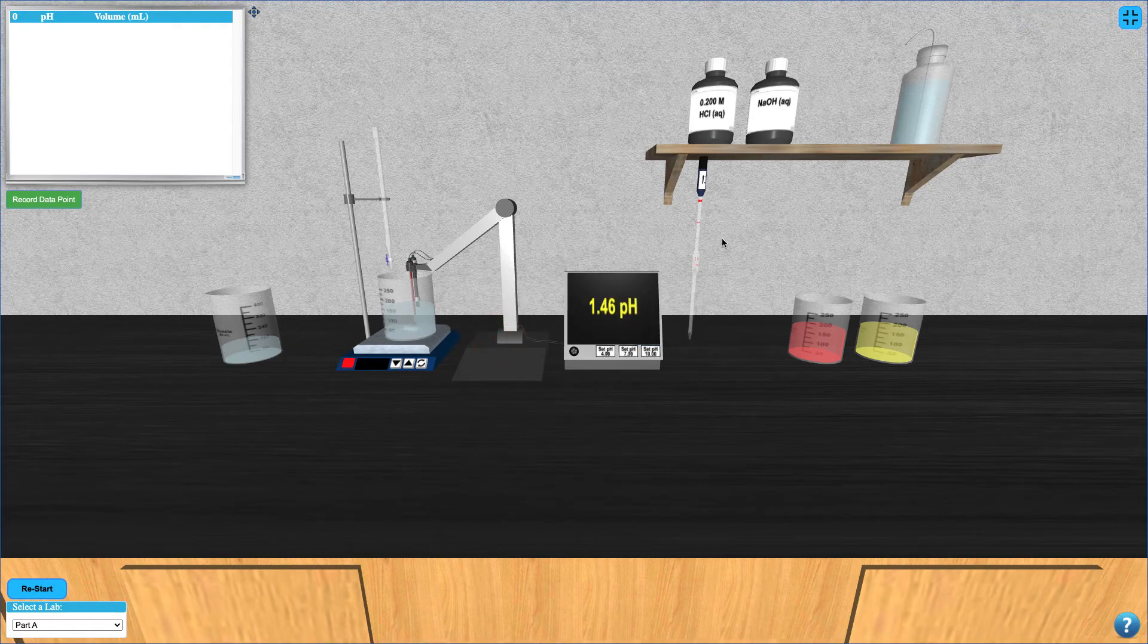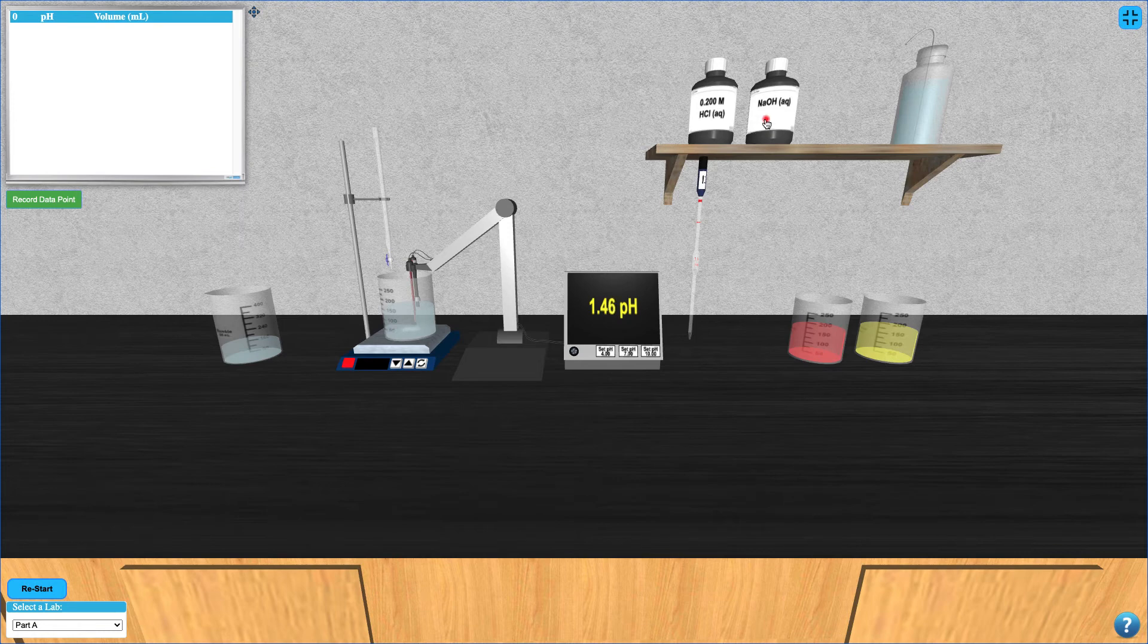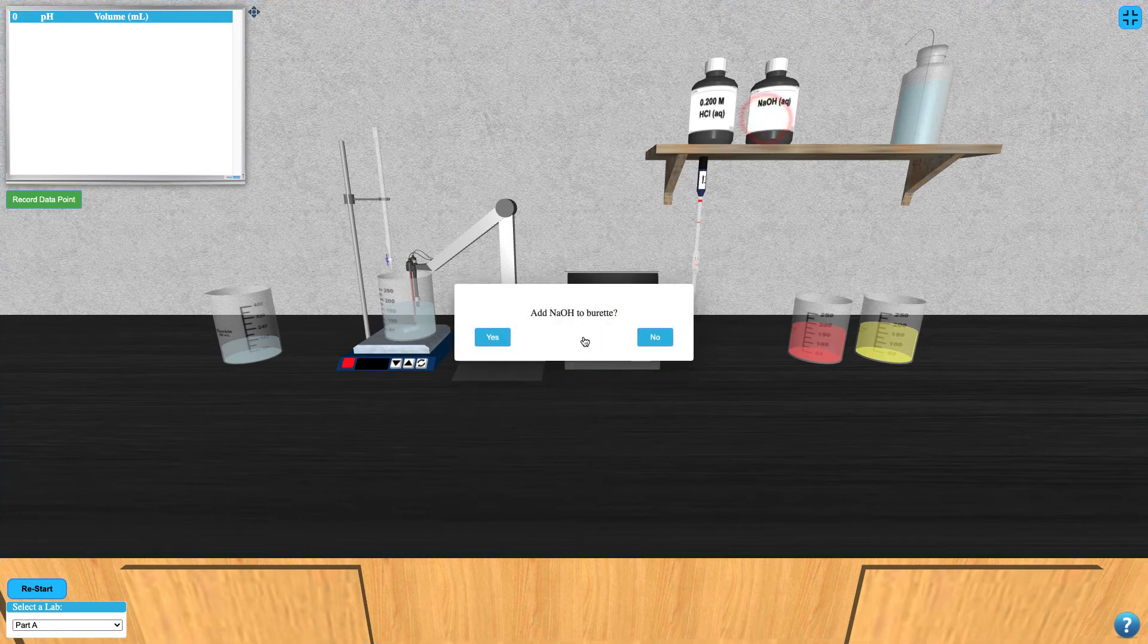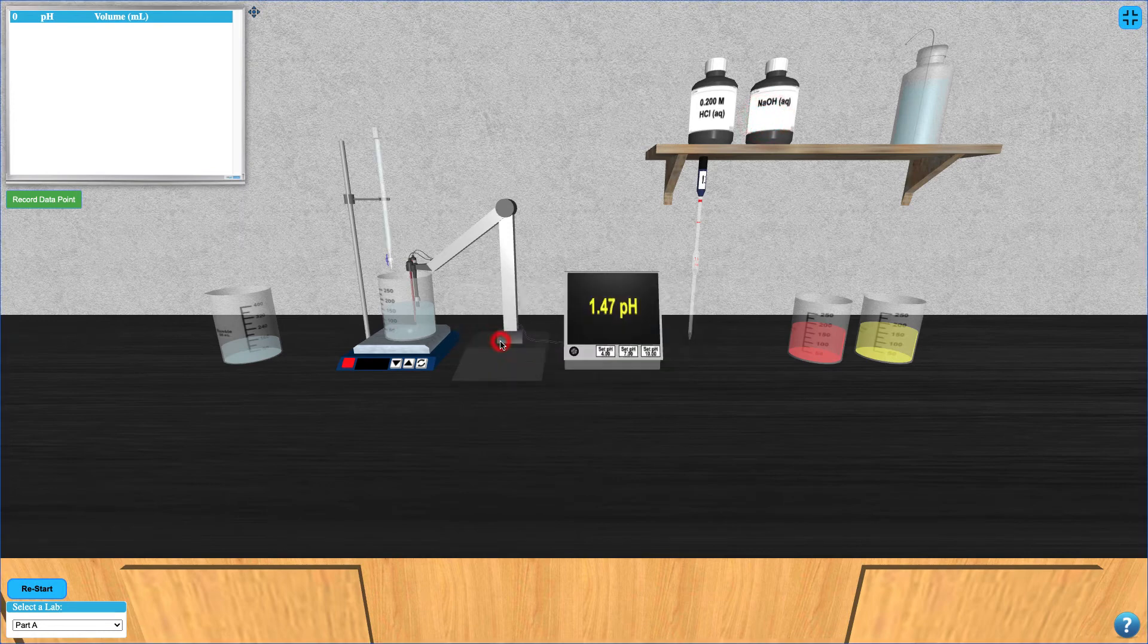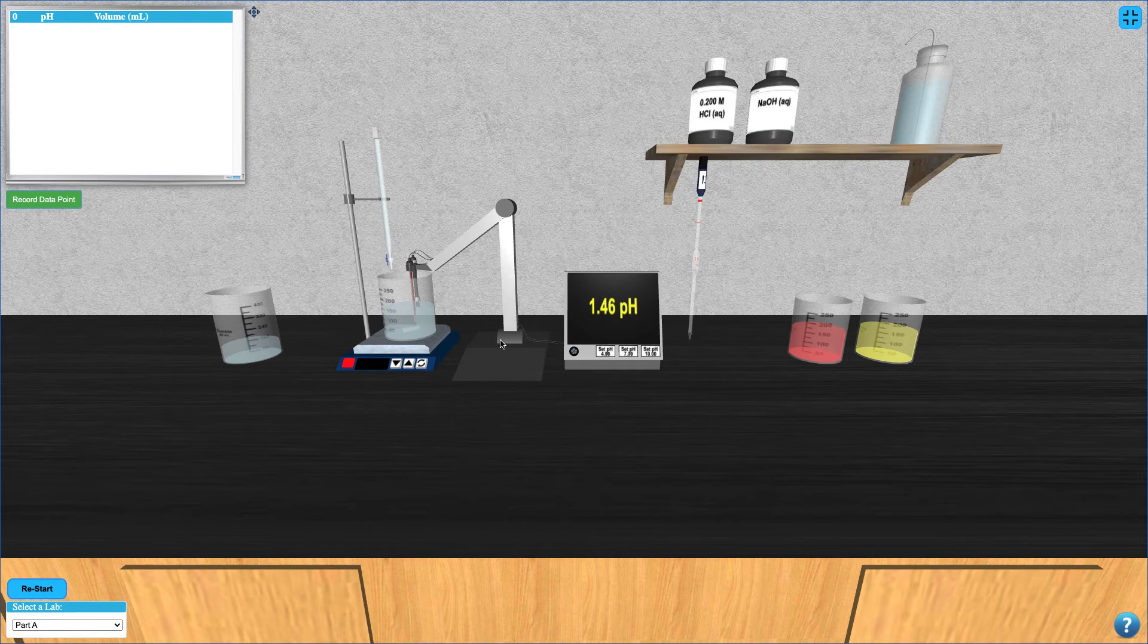At this point, you can fill the burette with NaOH by clicking on the NaOH bottle. Use the down arrow key to drip the NaOH solution from the burette.